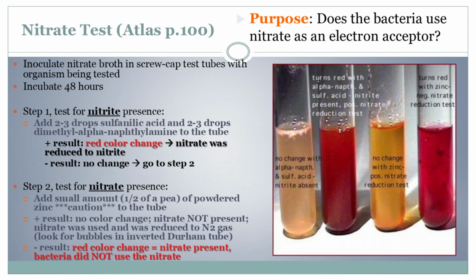Oh, I believe it. So how do we actually set up this test? What's our game plan here? All right, so imagine this. We've got a test tube, right? Okay, got it. That's our little crime scene. Love it. Inside, we've got our bacteria hanging out, just doing their thing in this nutrient-rich broth. It's like a buffet for bacteria. Exactly. Now, this broth also contains nitrate. That's the potential oxygen substitute we talked about. So we're giving our bacteria the option to dine on nitrate, if they're so inclined.